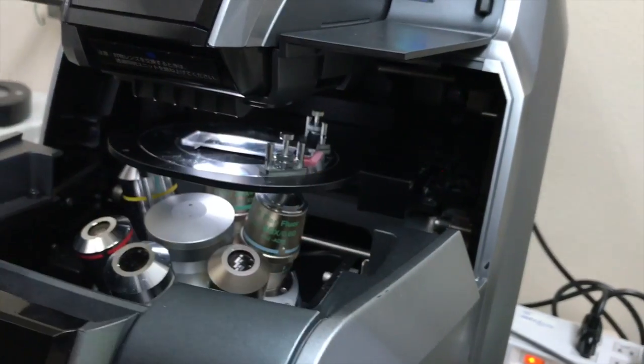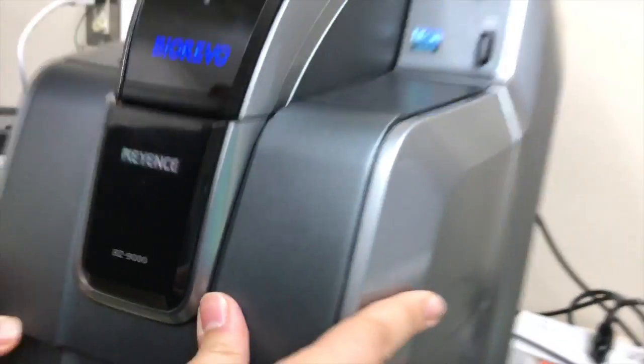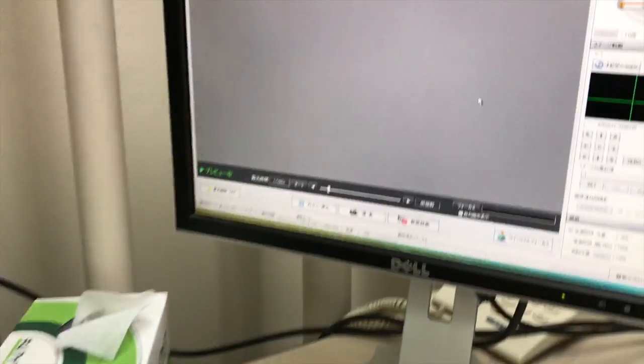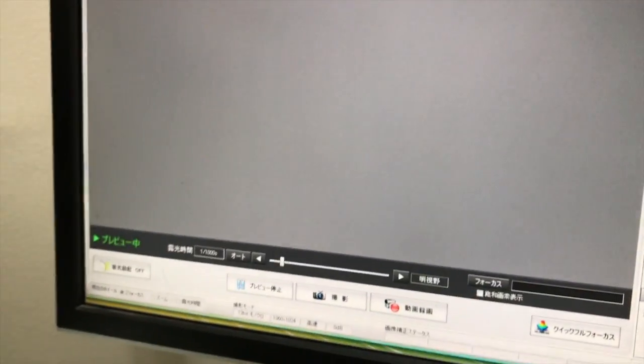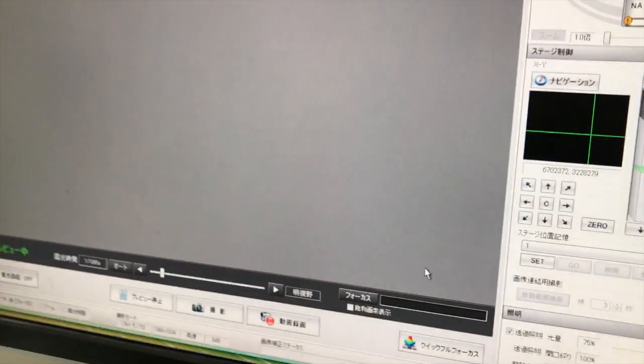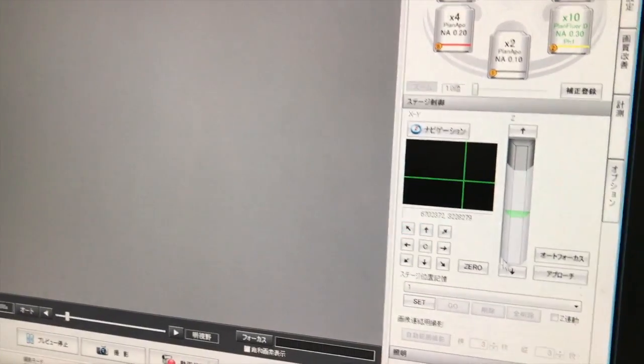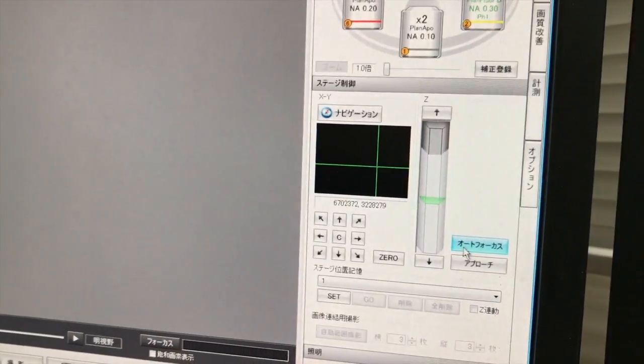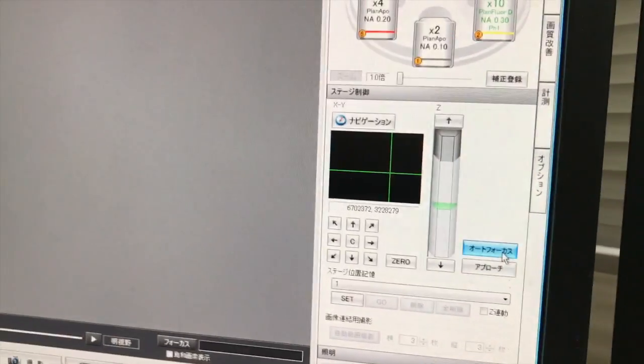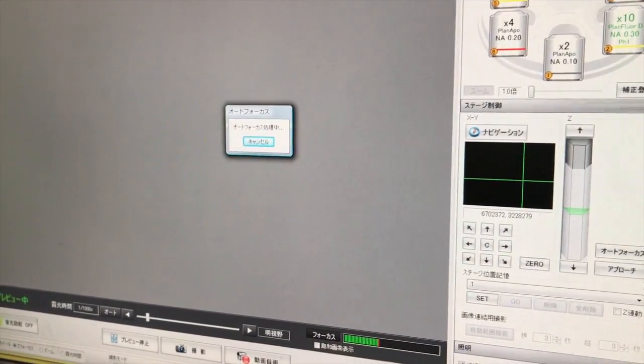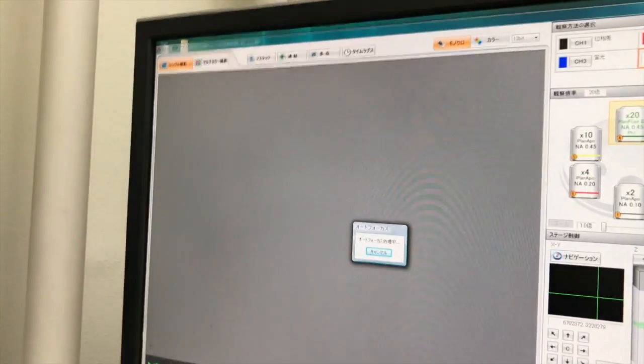So just hold on to that. You should use the autofocus function. You can adjust the focus using the scroller here, the mouse scroller. And the first time, you should press this autofocus. Because the focus adjustment is very, very difficult. It's not easy, really.